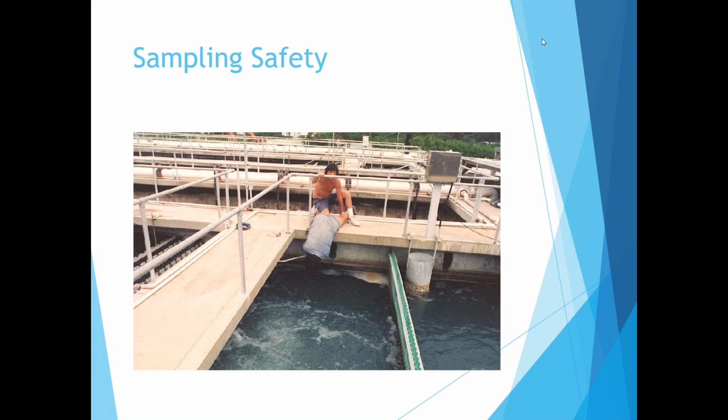Cornell, I have a question. Should temperature in an automatic sampler be maintained at or below 6 degrees Celsius? In a refrigerated sampler, yes. It should be maintained less than 6 degrees Celsius.